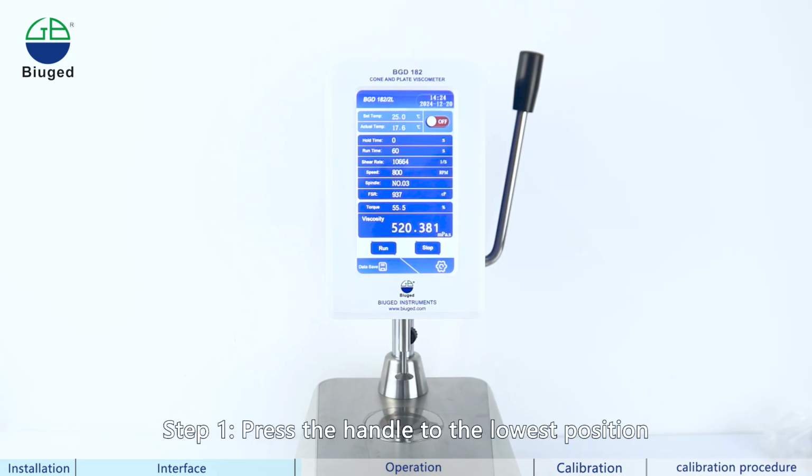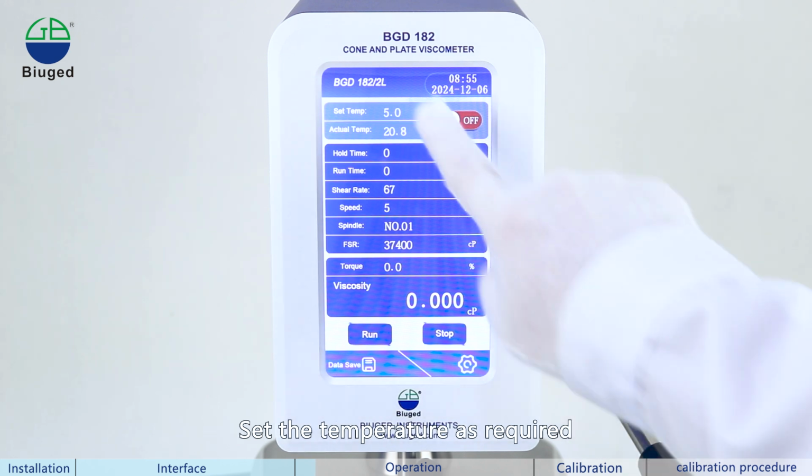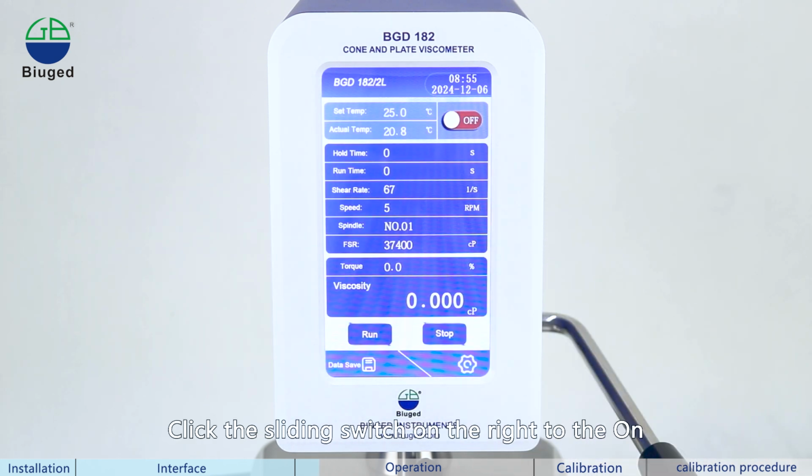Step 1. Press the handle to the lowest position. Step 2. Set the detection parameters. Set the temperature as required. Click the sliding switch on the right to turn it on.